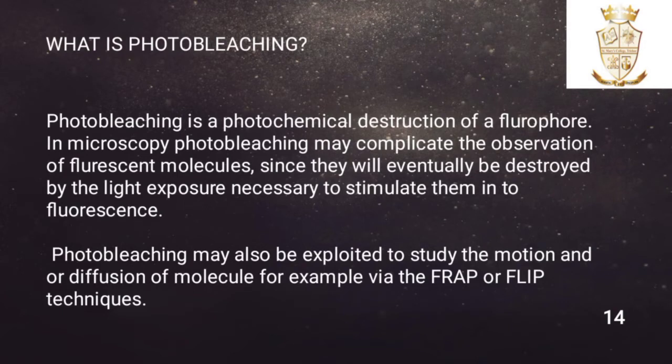Photobleaching may also be exploited to study the motion and or diffusion of molecules, for example via the FRAP or FLIP technique. FRAP, fluorescence recovery after photobleaching.